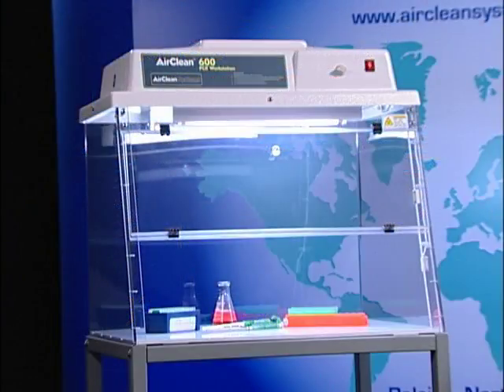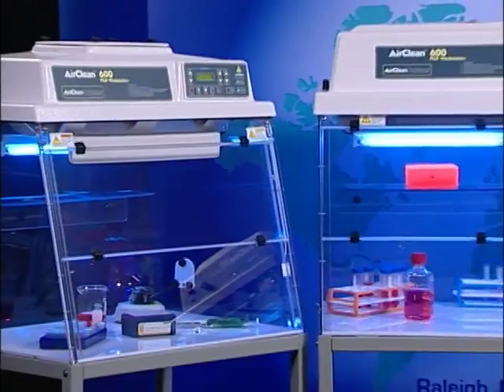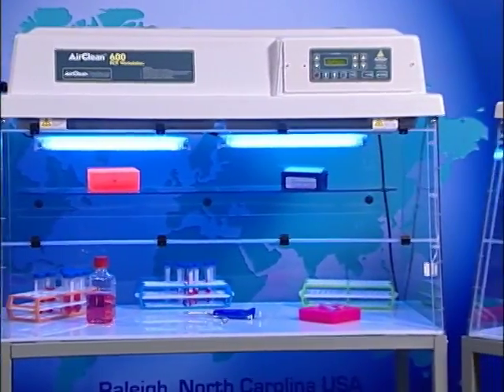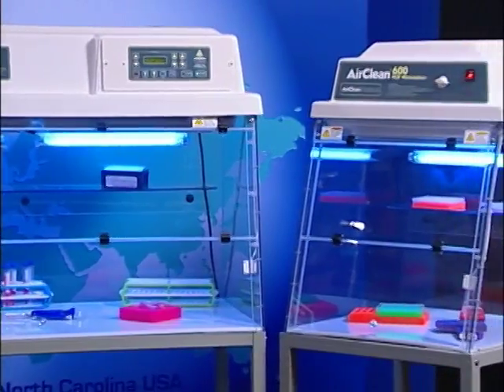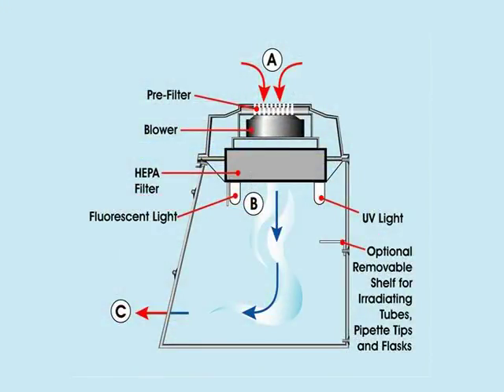The dead air box provides a small enclosed workspace that can be used for amplifying DNA and RNA. The combination workstation with UV-tect controller is AirClean Systems' solution to preventing cross-contamination during the amplification of DNA and RNA. The combination workstation utilizes a two-stage filtration process, ensuring that all air within the work area is filtered to ISO 5 clean bench standards.